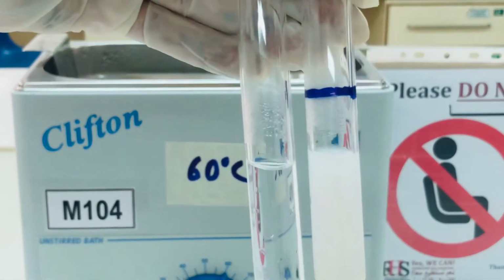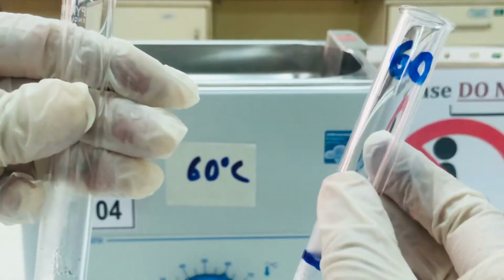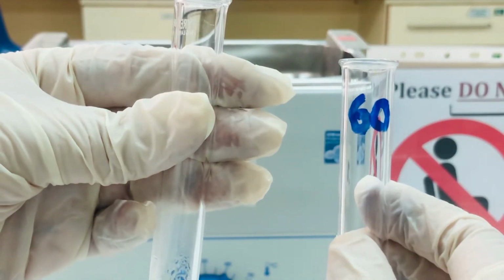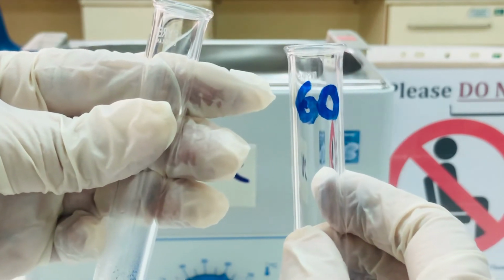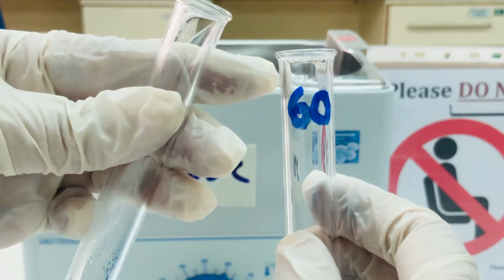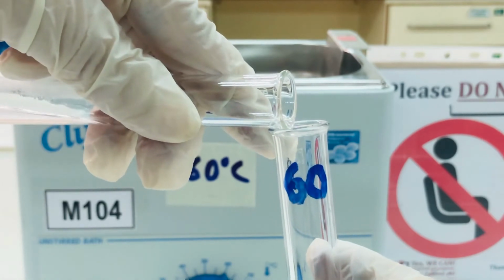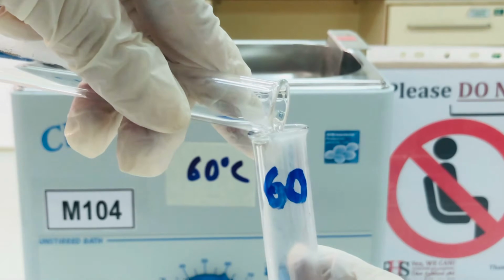As you can see, the two solutions, milk solution and the trypsin, both are at 60 degree. Now I am going to add trypsin solution to the milk. As soon as I add it and mix it, we are going to start the stopwatch. So you can see the trypsin is being added to the milk.